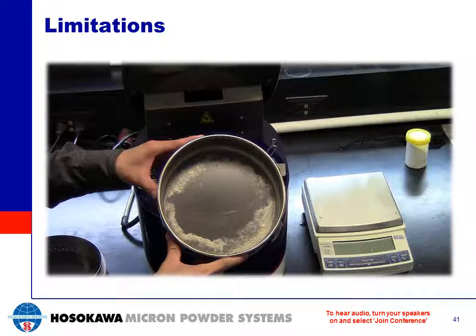This is why it's extremely important to clearly understand the scope that you're about to measure and the purpose of the measurement. Even though there is a vast array of analytical techniques and equipment to determine the particle size distribution, each technique is going to have its benefits and limitations.